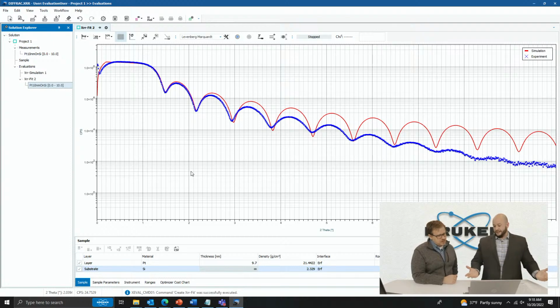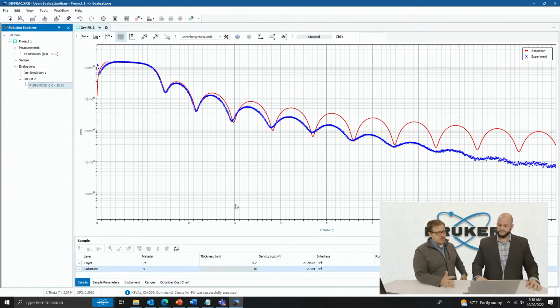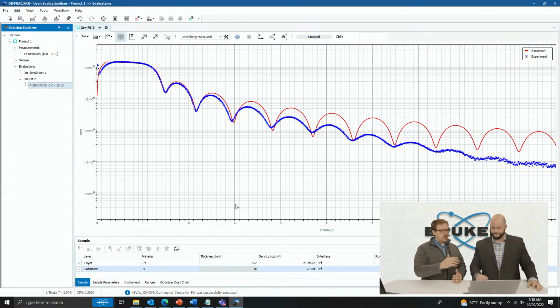And you can actually see it aligns quite well to the model, especially this critical edge here. And one thing I like, too, is how the software automatically brought in the line, the simulation being a line. Yep. And then the data points are actually little x's. Yeah. So that really helps to visualize that differential between the two. Yep, exactly. Okay. So now we kind of have to play around with the different parameters.